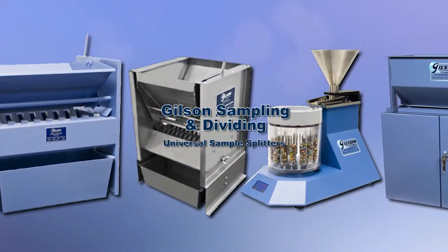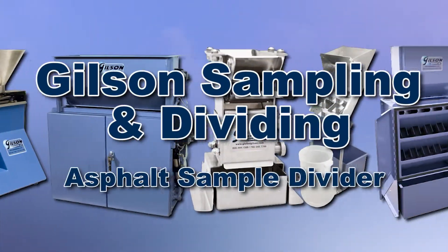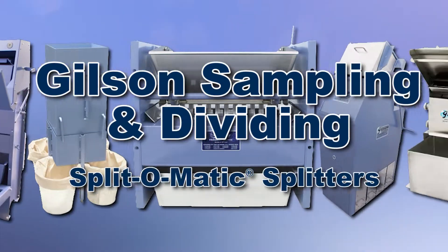With Gilson's complete family of splitters and sample dividers offering a wide range of performance, features, and capacities, Gilson has the right equipment to fit your needs for fast, accurate, and reliable representative sampling.